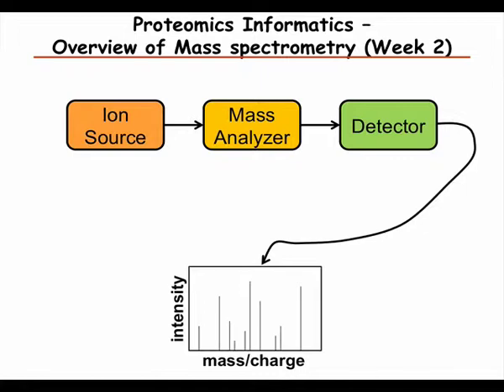In general, the way it works is that if you have a lot of material, you will have a large intensity.